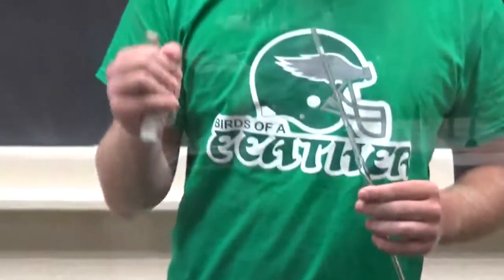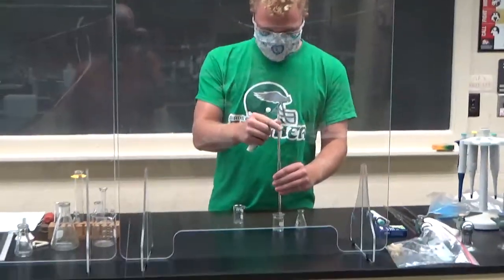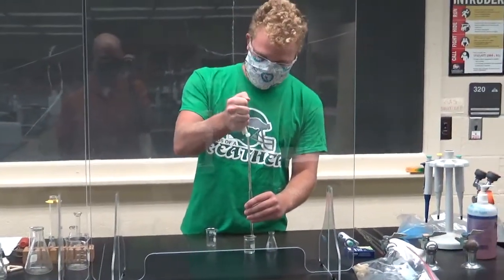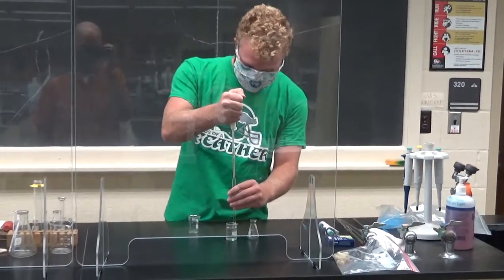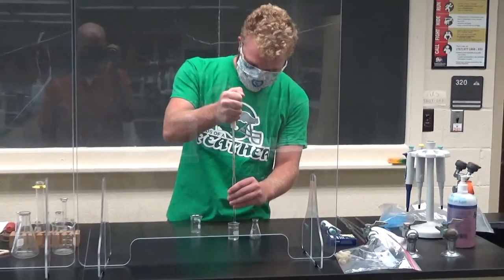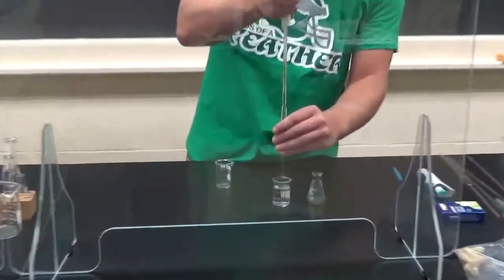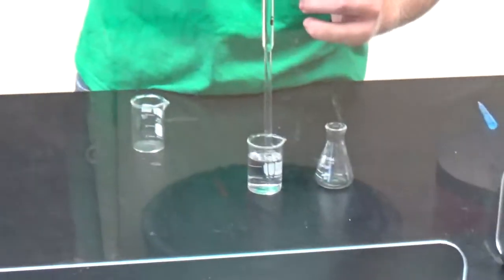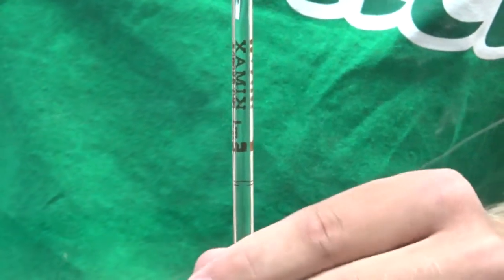When you want to pipette into something, you always want to make sure you clean out your bulb to make sure there's nothing in there. When you want to pipette, you slowly draw up. You place the pipette bulb on top of the pipette and slowly draw up the solution or water. You want to come past the line here, that's five milliliters.